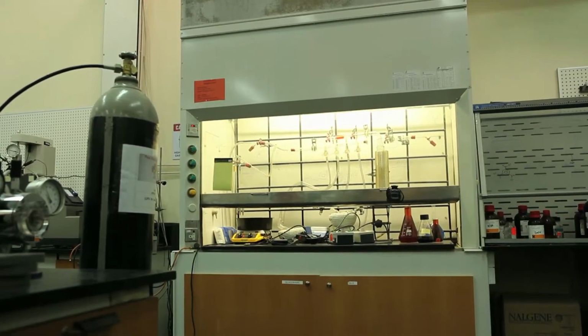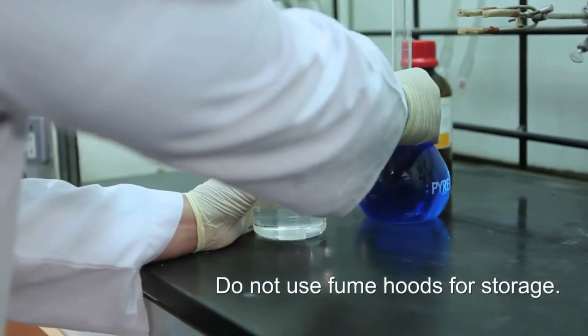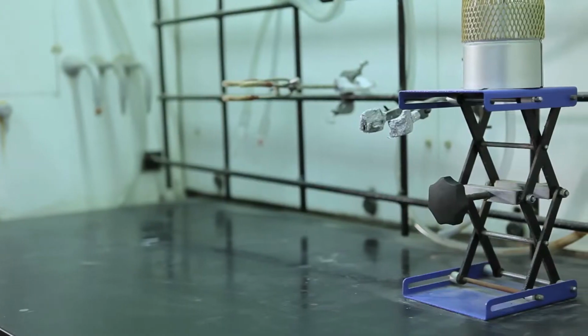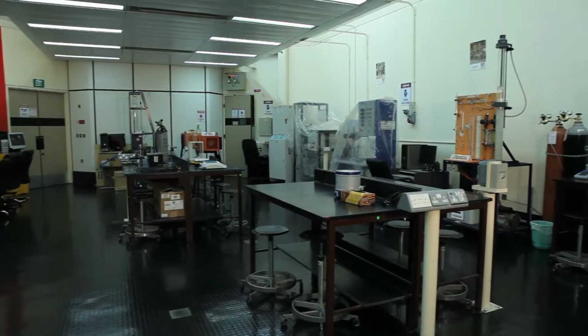Fume hoods must be carefully operated, maintained, and kept free of unnecessary clutter. Do not use fume hoods for storage. Organize and minimize necessary chemicals and equipment. Keep chemical containers within the fume hood closed. Ensure proper functioning of audible and visual alarms.